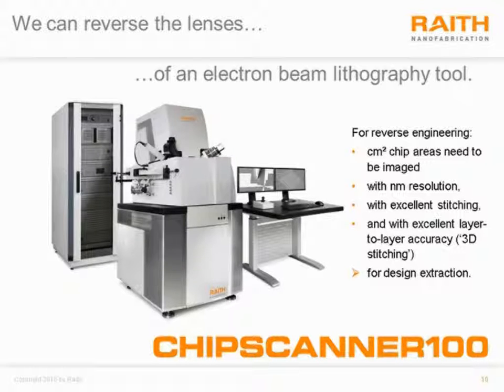The images can be stitched together with very high accuracy, and the images can be stacked layer by layer to a very high accuracy as well, and we call that 3D stitching. And so the chip scanner has been serving our clients in reverse engineering for the last 15 years.